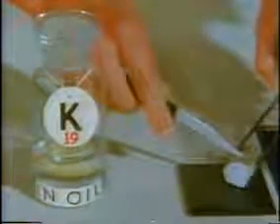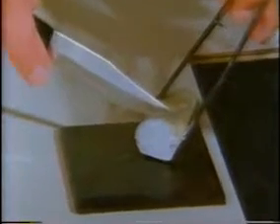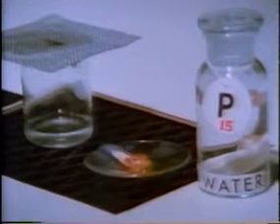Chemists divide the substances around us into compounds and elements. Let's look at the elements. Here is the chemical element potassium. It cuts easily, and its shiny surface dulls as it reacts with air. Potassium also reacts with water. By contrast, the element phosphorus is stored under water, but it too reacts rapidly with air. Phosphorus and potassium are similar in reacting with air, but they differ in appearance and in their behavior toward water.